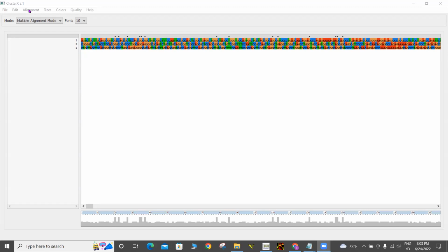You go to NCBI, you type that gene name, and then you need to do the BLAST, and then you get many sequences there, many closely related sequences. You just need to pick 2 or 3 or 4, depending on you, and then you copy one sequence at a time. Do not copy all of them.